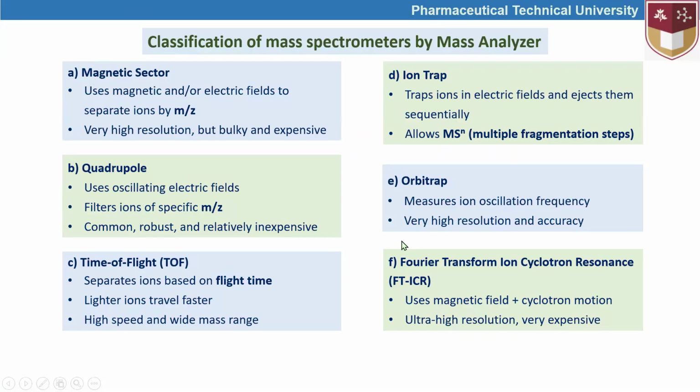Okay, here we go. Mass analyzers are the second vital instrument, let's say, of mass spectrometers, and different types of mass analyzers have been used for different types of mass spectrometers. In this video lesson, we are going to talk about them and understand how they work.